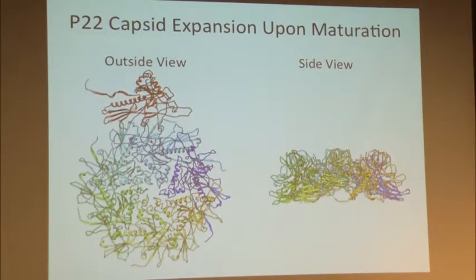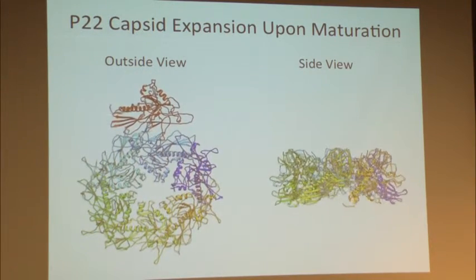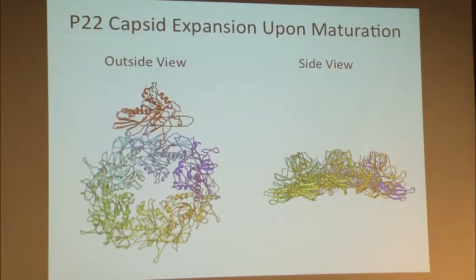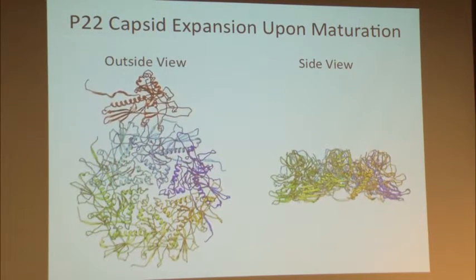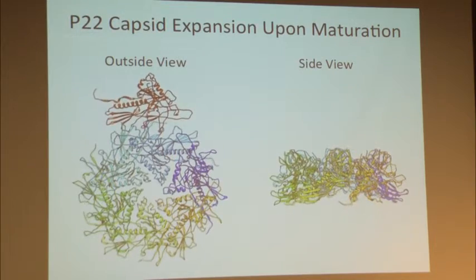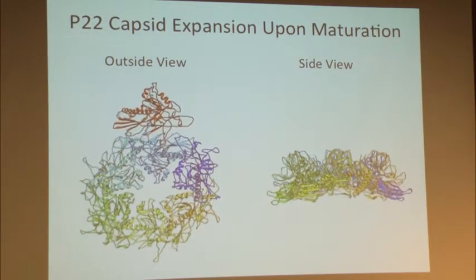That conformational change does not involve proteolysis. It does not involve only one domain. It actually involves multiple segments of the polypeptide, in such a way that the central hole of the hexon is closing up. The interface between subunits gets more intimate during the maturation process. So I think this can all be done at a 3 angstrom level without crystallography.